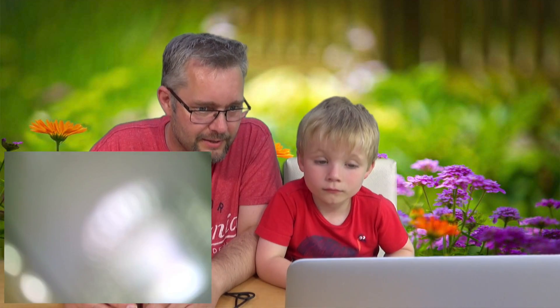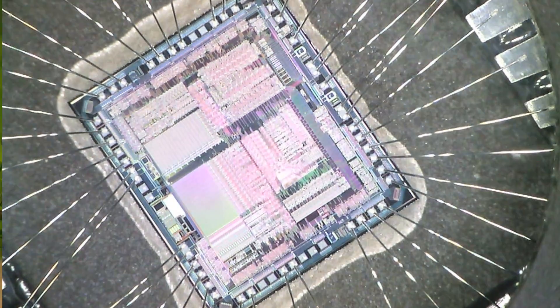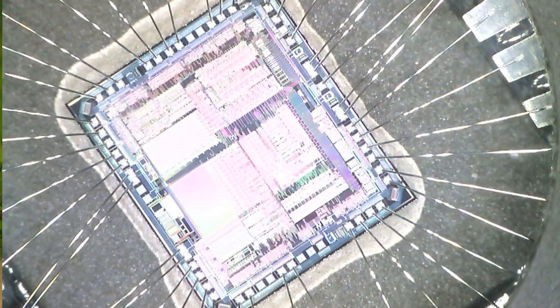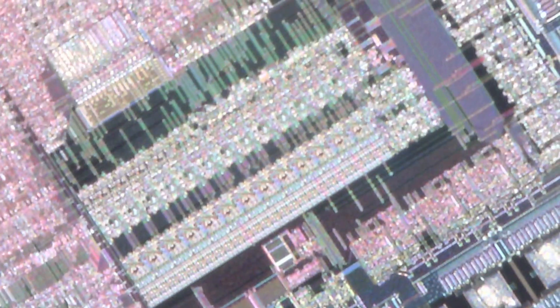Let's have a look at a microchip. Most TVs and other things like that have got these in them. This is a microchip — look at that. This looks like it's got a whole city inside it, doesn't it? We can go even closer, right in through the glass. That's what a microchip is made up of — all those tiny little bits. And if you look carefully, on the edge there are little tiny wires that connect all the circuit together. Inside it's all these little bits. If someone has to make that, how on earth do they do it? That's crazy!